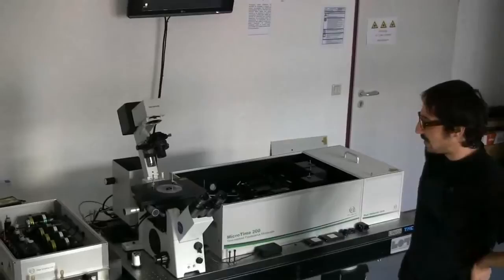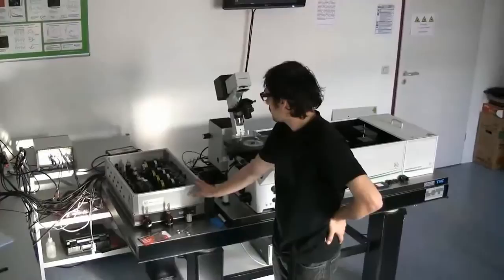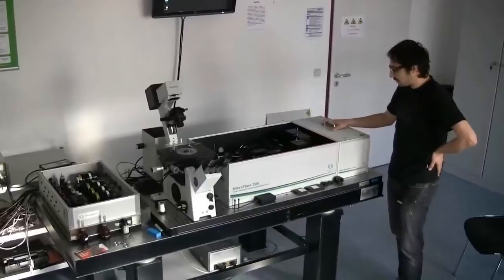Basically the whole system consists of three major components. The first one is the built-in microscope stand. The second one is the excitation unit, which houses a couple of laser diodes. And we have the main optical unit that contains all the confocal optics, mechanics, excitation and detection unit. Then on the right hand side we have another box which contains another two sets of detectors.